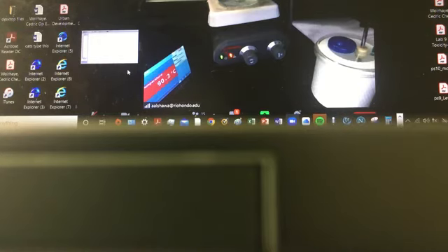Okay, so it's not moving. Now it's flickering to 90.3, between 90.2 and 90.3. But within a minute, if that value does not go up drastically or go down drastically, we're going to just accept it.